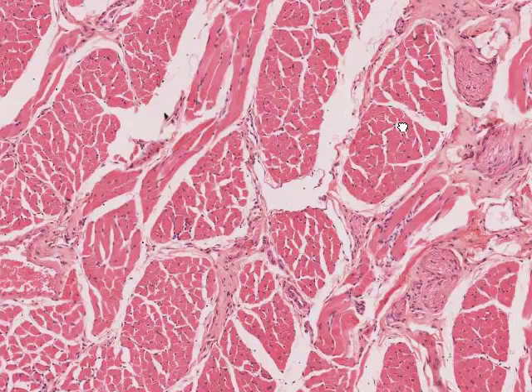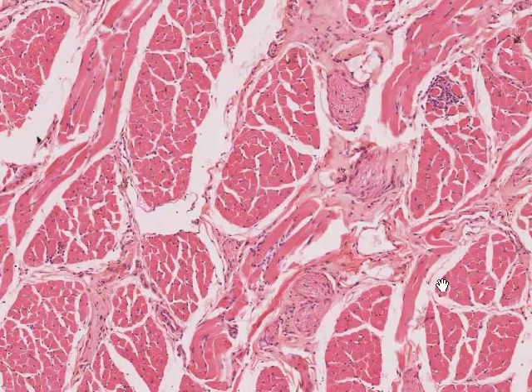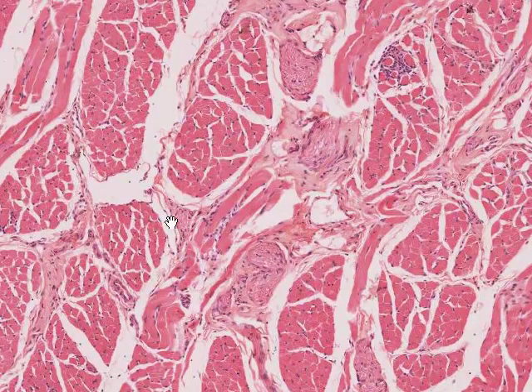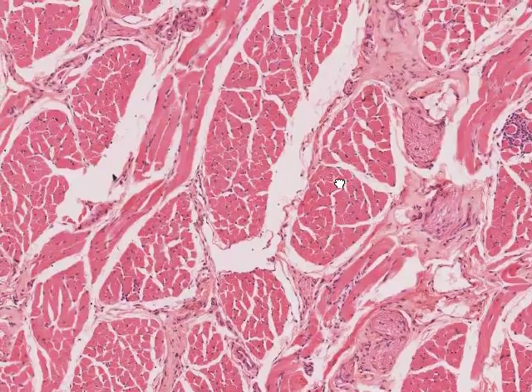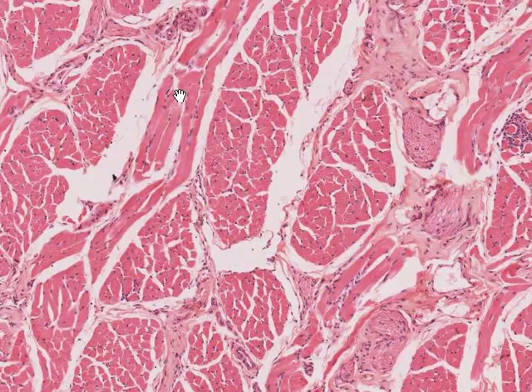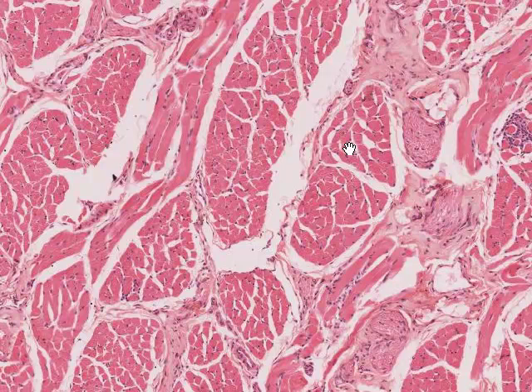If we increase the magnification a little and look at this region, hopefully you should be able to identify that what you're looking at here is skeletal muscle cut in cross section, and here is a little bit of skeletal muscle cut in longitudinal section. One thing I'd also like you to notice is that here is a piece of peripheral nerve cut in cross section, here's another piece in oblique section, and another piece of peripheral nerve.